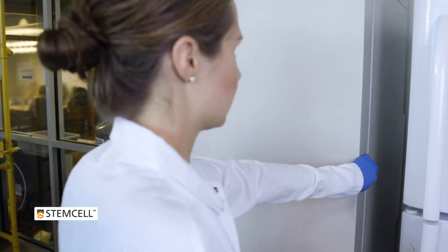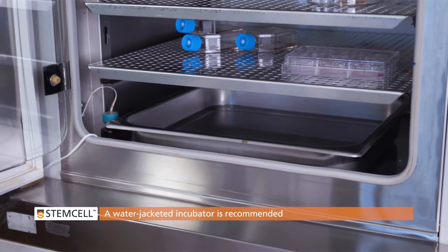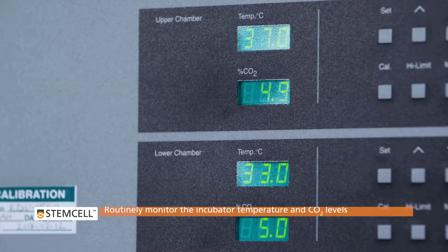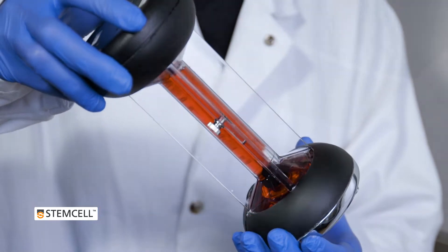Proper culture conditions are critical for optimal CFU growth. We recommend the use of a water-jacketed incubator that includes a water pan in the chamber. Best practices include the routine monitoring of both the temperature and carbon dioxide levels within the incubator.